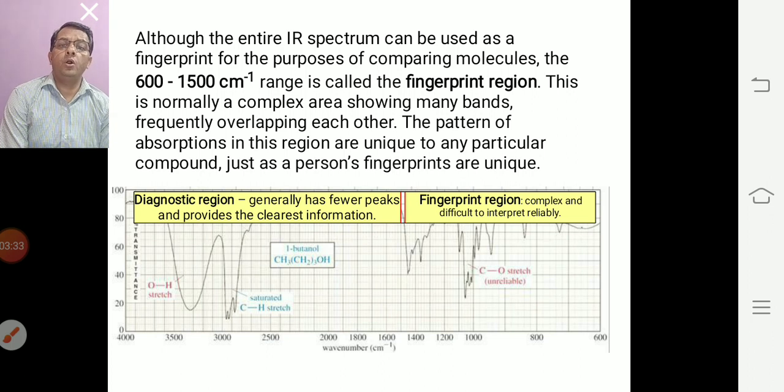Next, do not expect to be able to assign every band in the spectrum. Keep cross-checking wherever possible. Band intensity should be treated with some caution. Published descriptions of band intensities, under certain circumstances, may vary considerably for the same groups. Study any variation between spectra obtained by different sampling techniques.